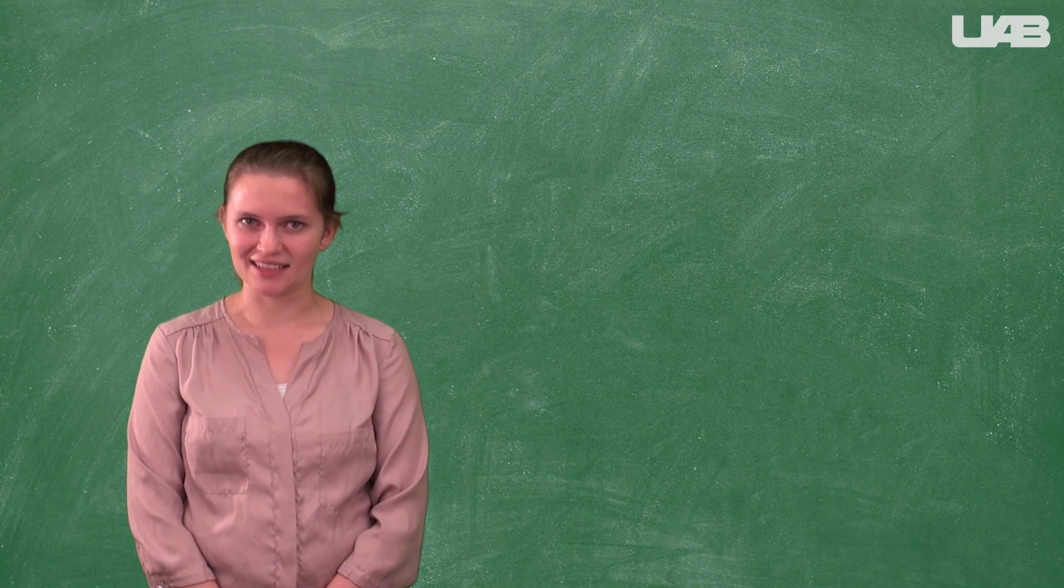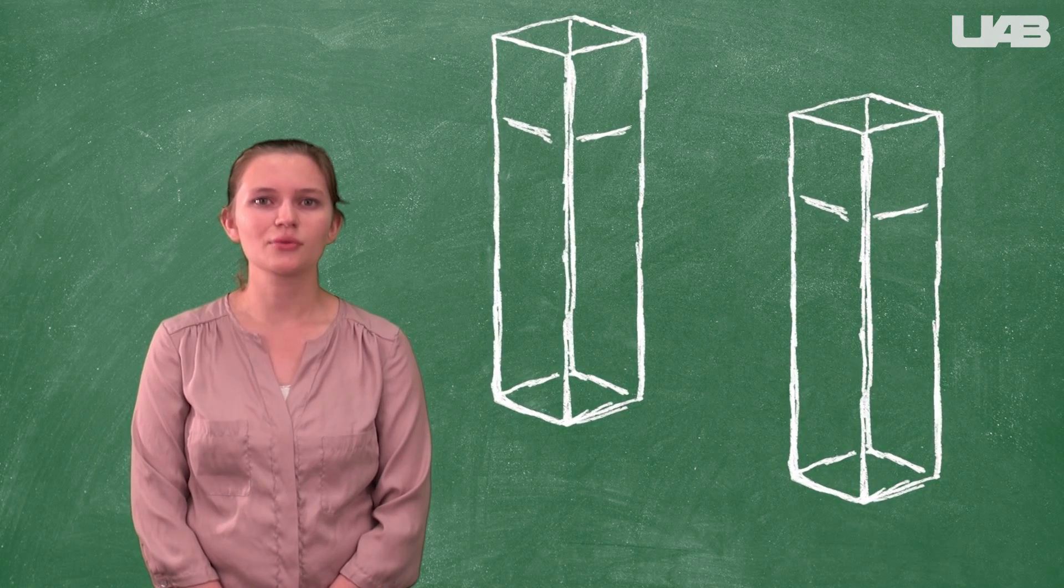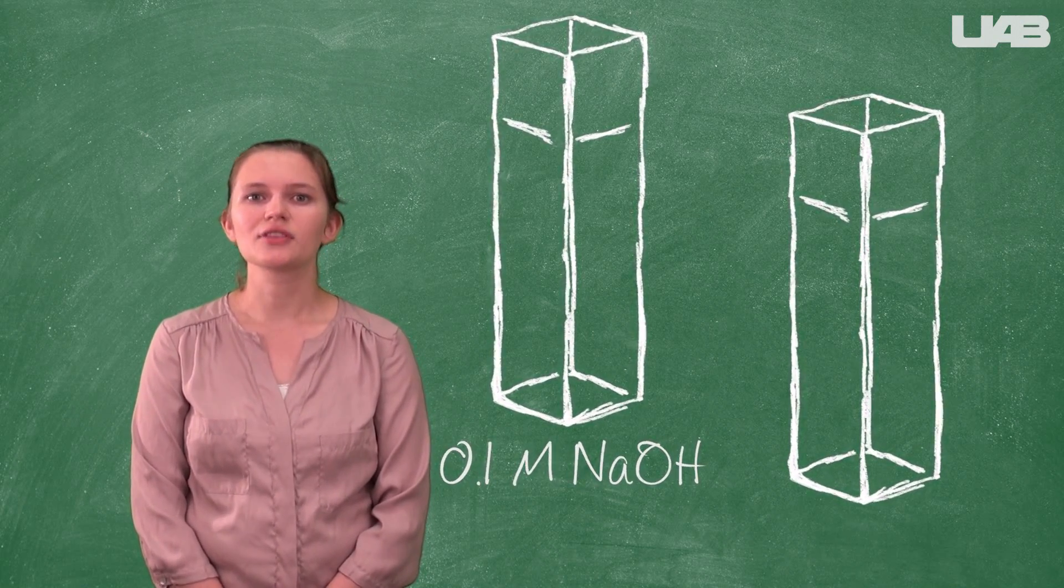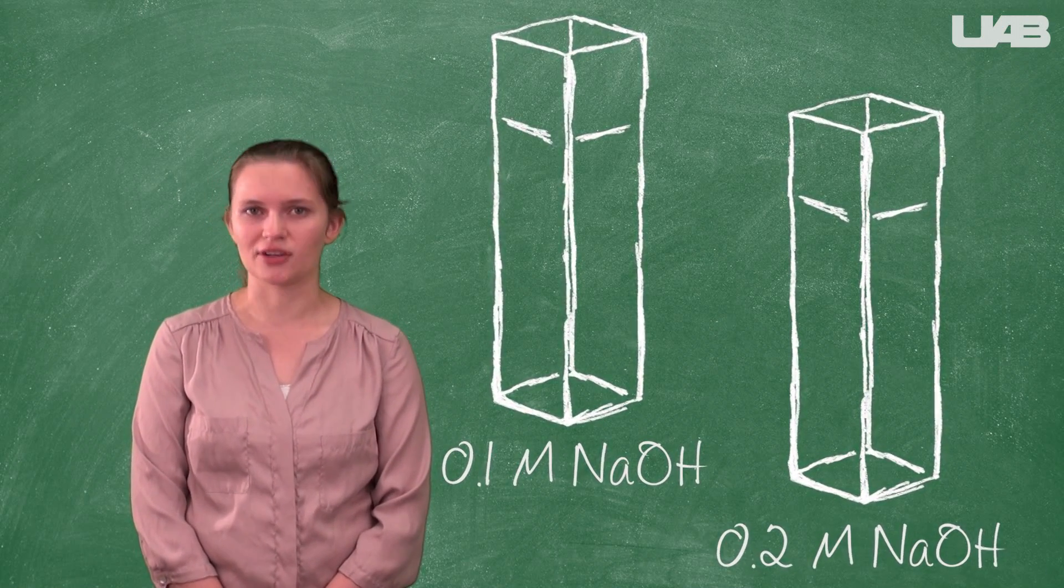Now it's time to collect our kinetics data. You should get two cuvettes. Fill one three quarters of the way full with 0.1 molar sodium hydroxide. And fill the other cuvette three quarters of the way full with 0.2 molar sodium hydroxide.